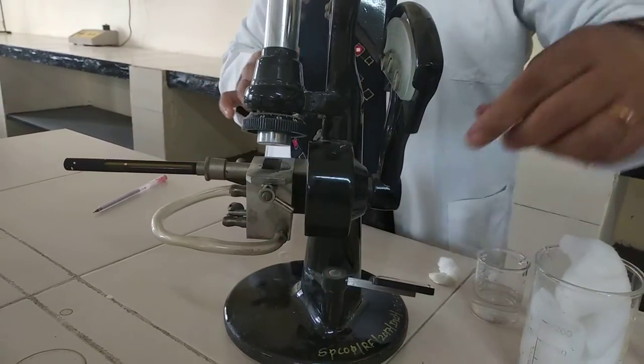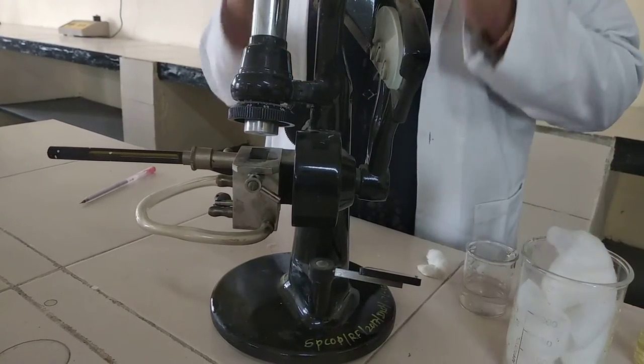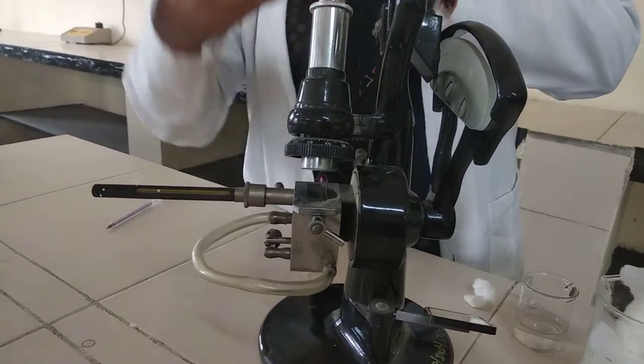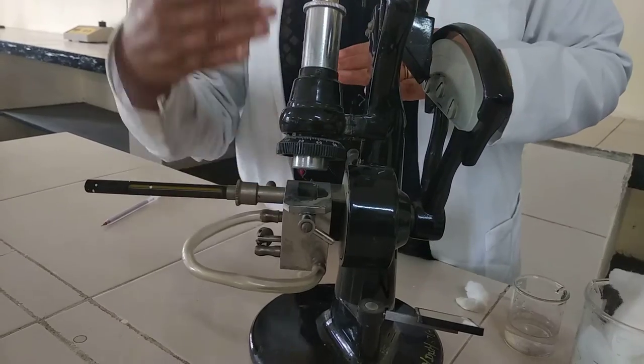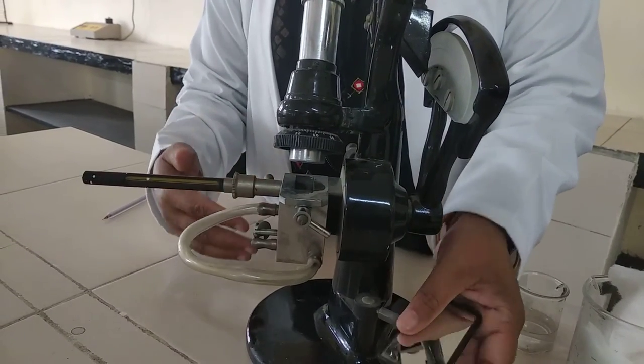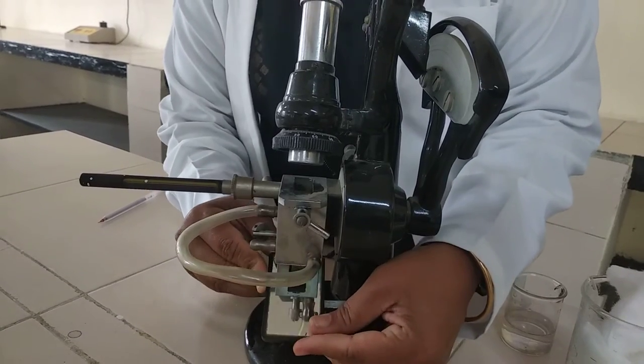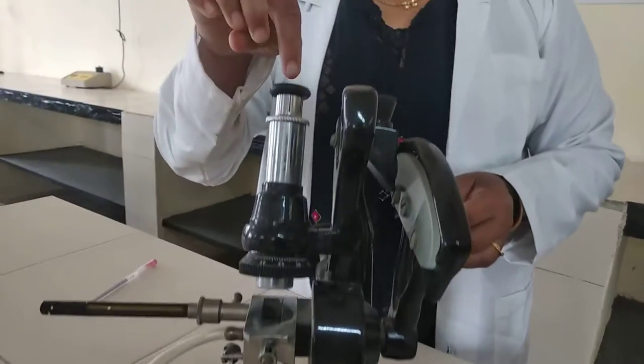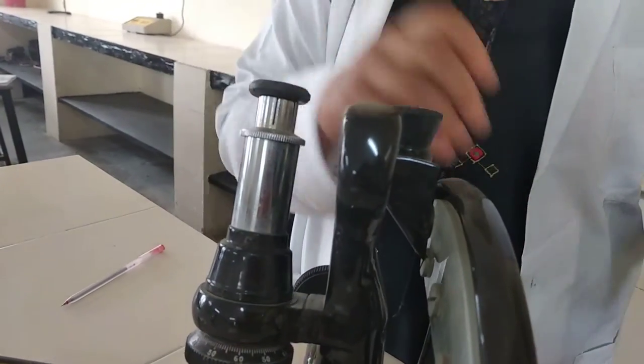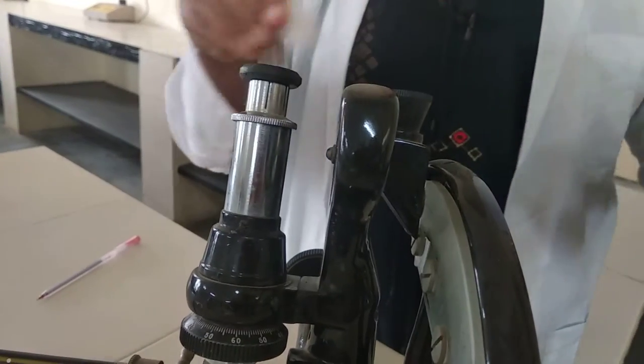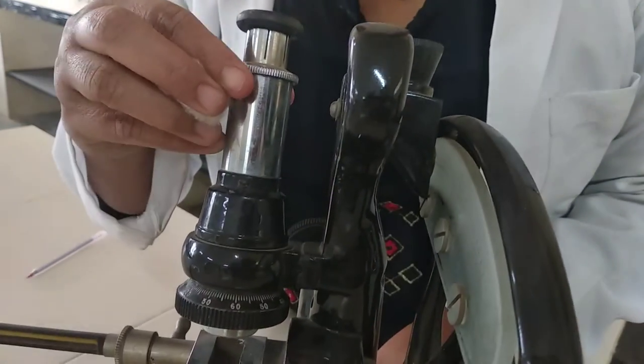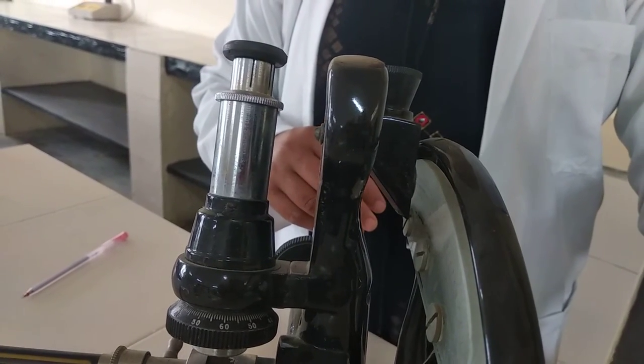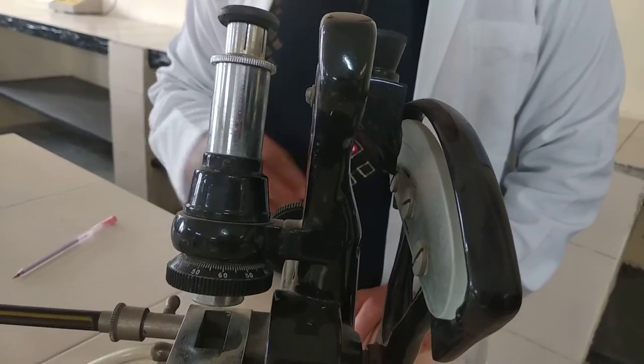When the prisms are closed, the liquid should be spread evenly to make it a thin film. After closing this prism, it will become a thin film. Next, the mirror turns to light. Here we have to adjust the mirror and look into this eyepiece. Afterwards, we have to look from this eyepiece. The mirror turns to light and look into this eyepiece.